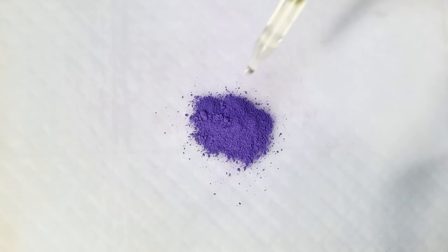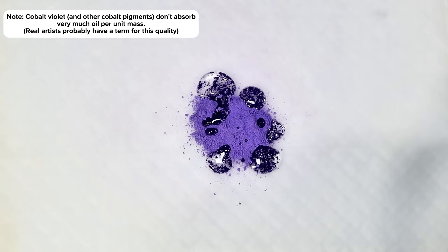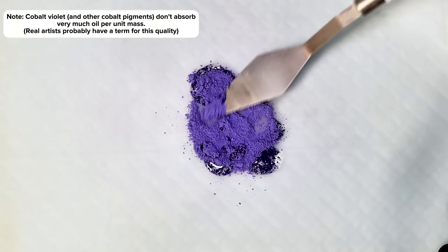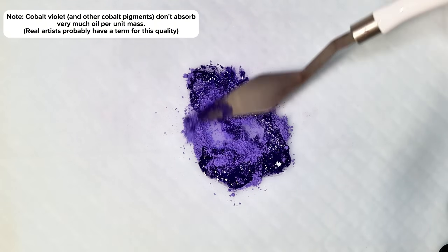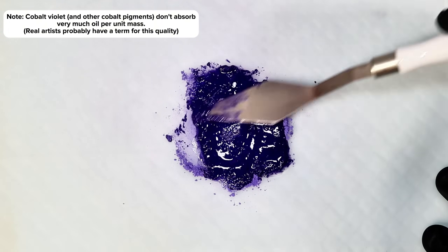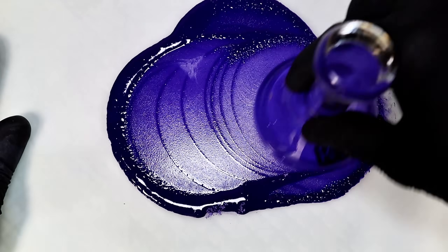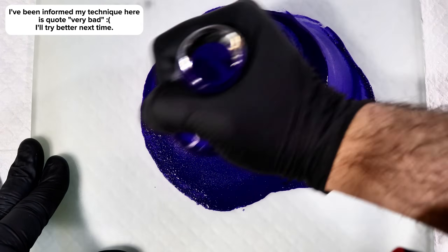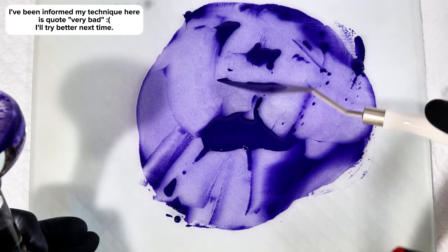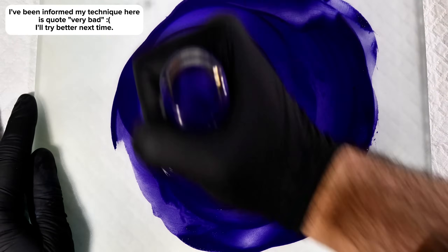To do this, I begin by adding a small scoop of cobalt violet directly to a ground glass plate followed by a few drops of linseed oil. I then use a palette knife to mix the two together as thoroughly as possible. At this point, I switch to using a muller to grind the pigment into the oil while simultaneously crushing the cobalt phosphate into even smaller particles. This continued for about 25 minutes until I felt I had a decent paint consistency.